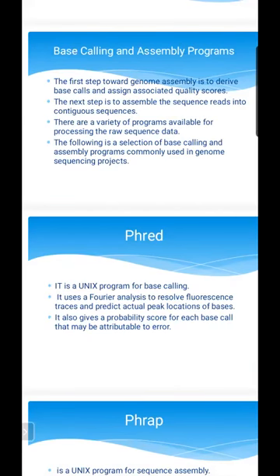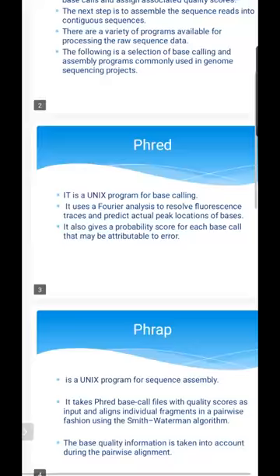The commonly accepted score threshold is 20, which corresponds to a 1% chance of an error. That means the higher the score, the better the quality of a sequence read. If the score value falls below the threshold, then human intervention is required.